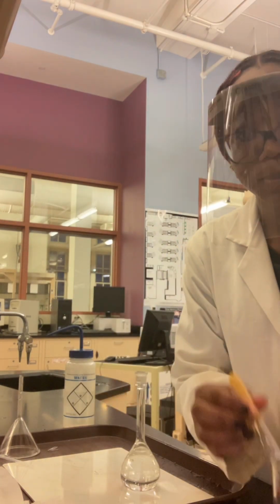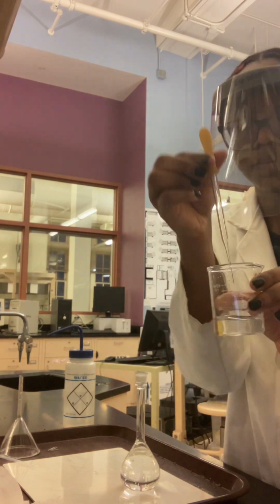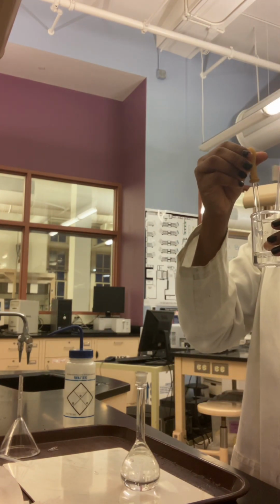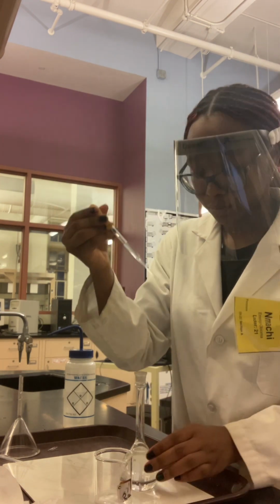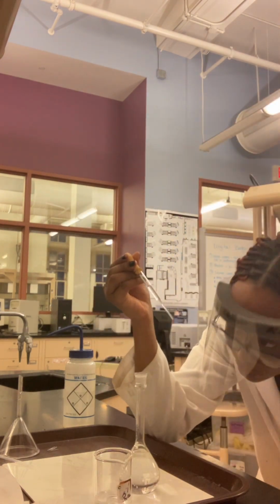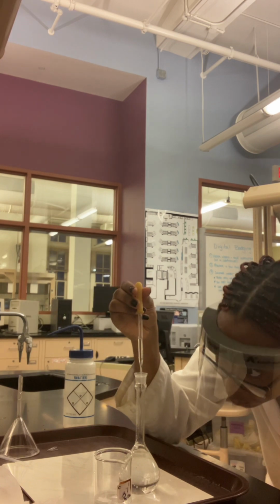Once I'm done mixing, I'll take off the parafilm and then switch over to using a pasteur pipette to adjust the volume of solution to the calibration mark.